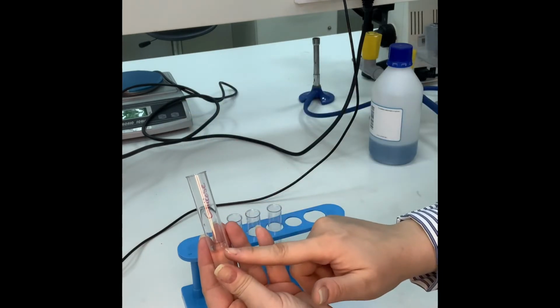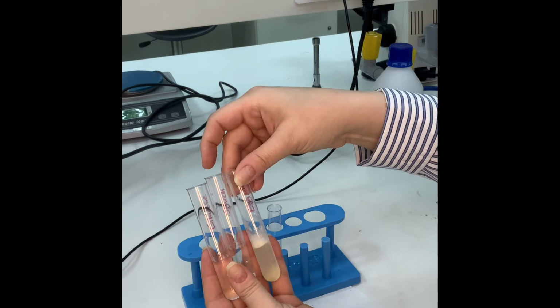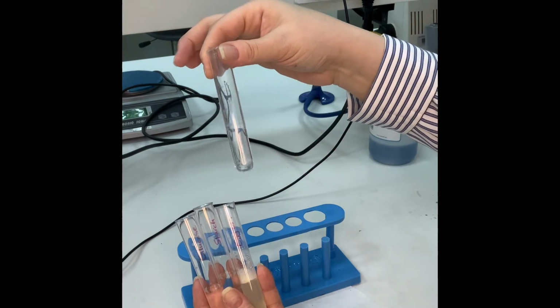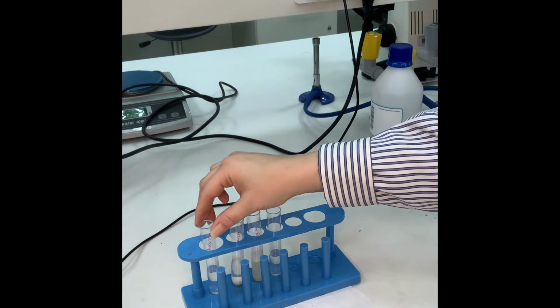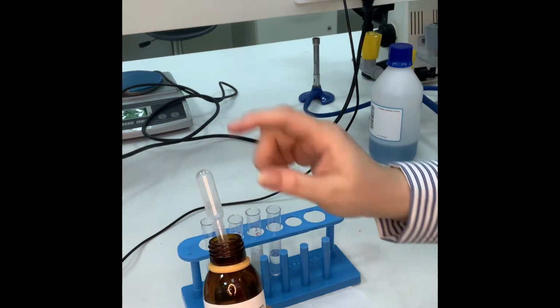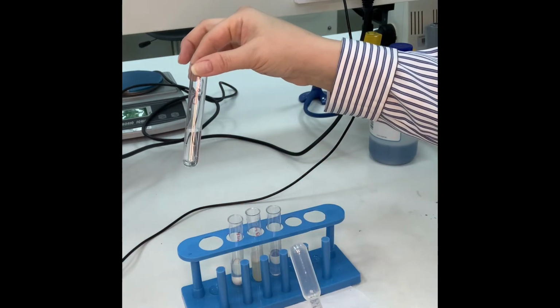Okay, so over here I have glucose, starch, egg white, and my negative control, water. So I will add a full withdrawal. Now a full withdrawal is almost 1 milli, which actually equals the 1 milli over here.